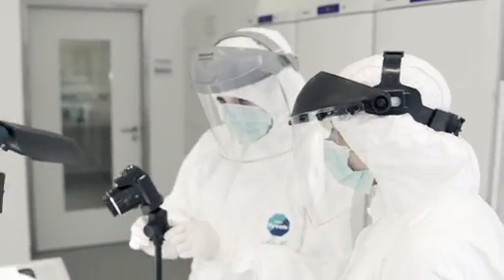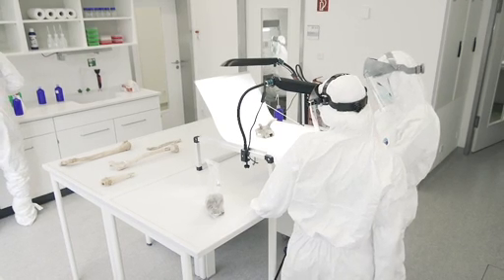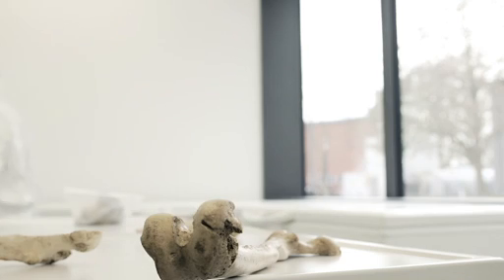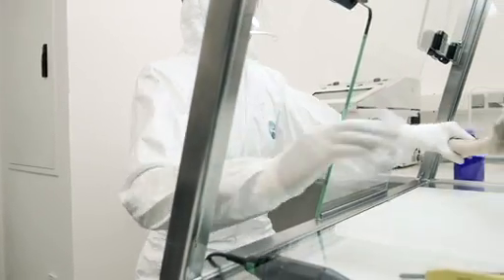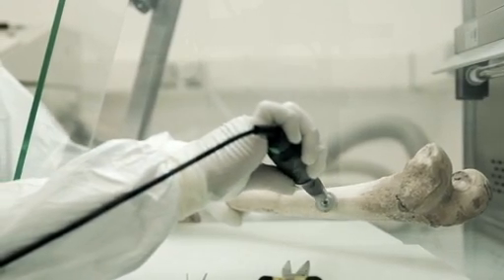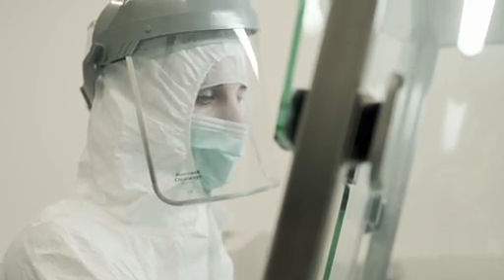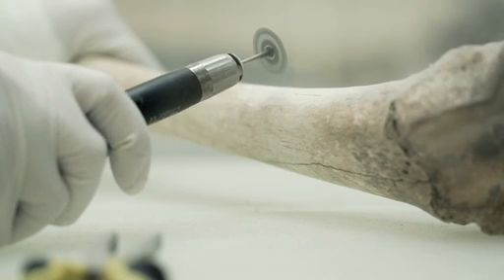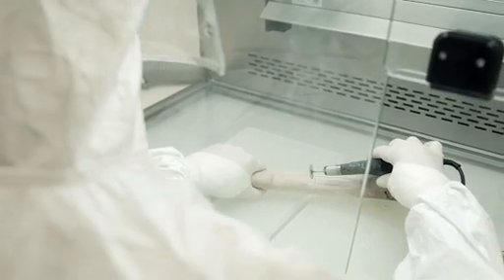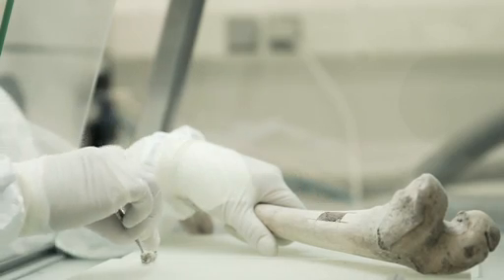This is the room where samples are photographed and documented. We try to select long bones or the roots of teeth for sampling. After the surface is removed, the bone is subsampled.